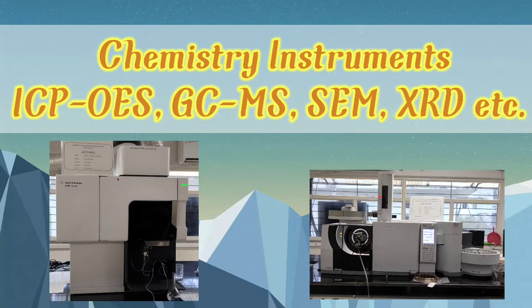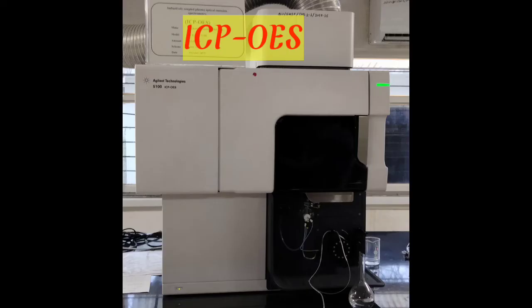We will discuss the chemistry instruments like ICP-OES, GCMS, SEM and XRD. All the information is in this video. Then we will start. First of all, we will discuss the ICP-OES, meaning inductively coupled plasma optical emission spectroscopy.